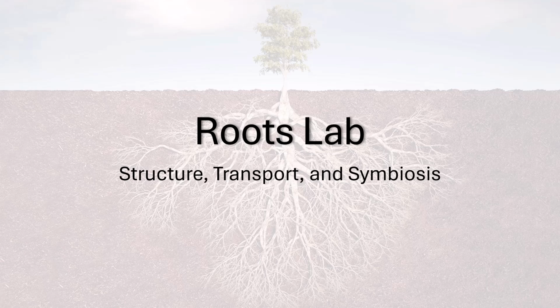Just like the Leaves Lab, this activity is designed to mirror what you would do in a face-to-face lab, observing prepared slides, making labeled drawings, and connecting microscope structure to whole plant function. By the end of this lab, you should feel confident identifying the major external and internal features of roots, comparing monocot and eudicot roots, and explaining how roots are adapted for transport, growth, and symbiotic relationships.